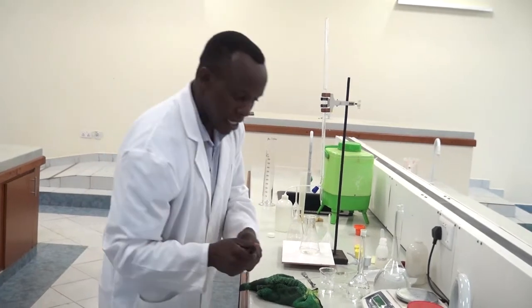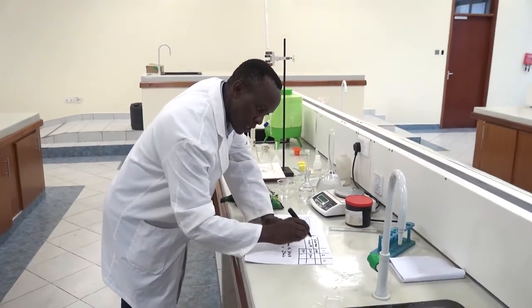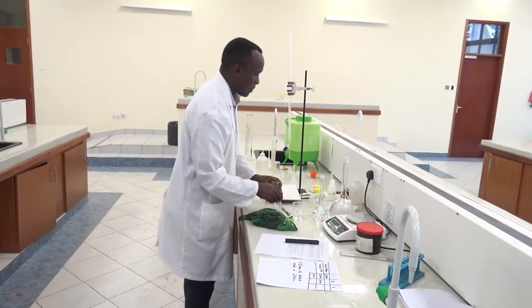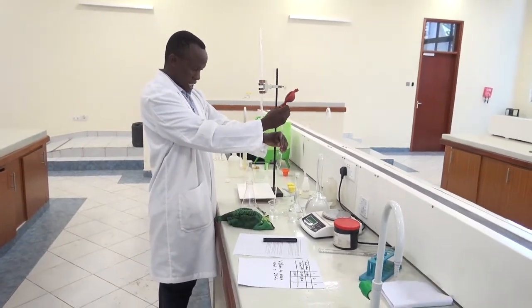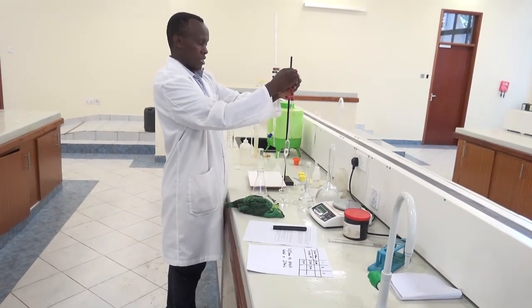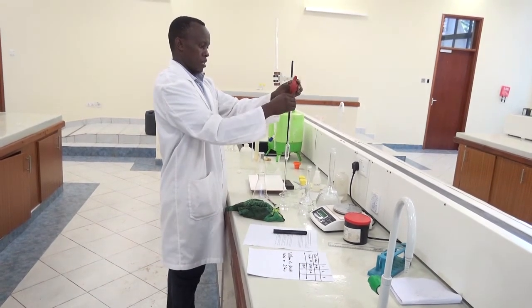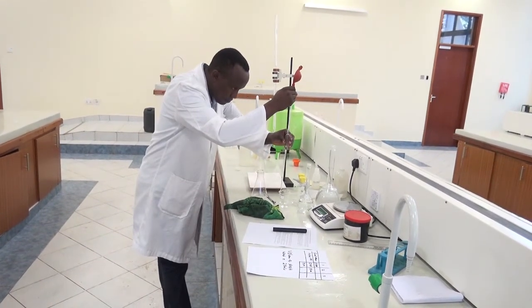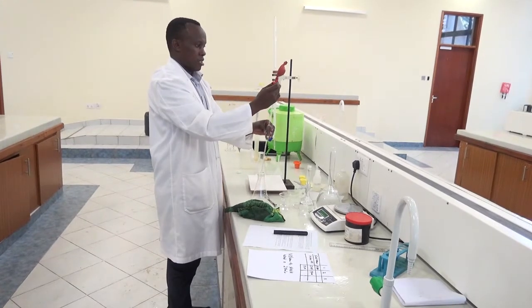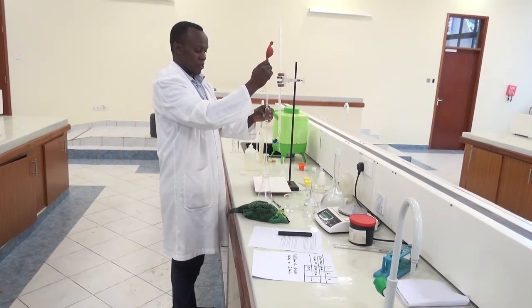Now my second initial volume will be the volume that I reached with the first titration, which is 19.00. So I pipette another 25 of the sodium hydroxide into the conical flask. I have pipetted my second 25 mLs of the sodium hydroxide.